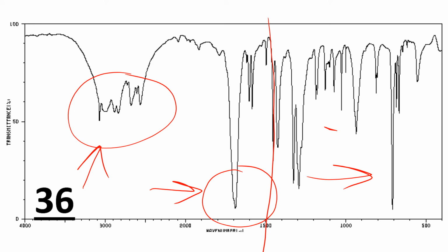Key points to wrap up are that the presence and absence of peaks are important. You should look for N-H, O-H, C-H, and C=O peaks first. You should describe your peaks with location, that is numbers, and those numbers should come from the table. A description of the peak, which should say strong or weak, broad or narrow, sharp or not, and that your goal here is to identify which functional groups it is definitely not. I find it's more useful to approach it from the position of trying to eliminate things rather than trying to work out what it definitely is.